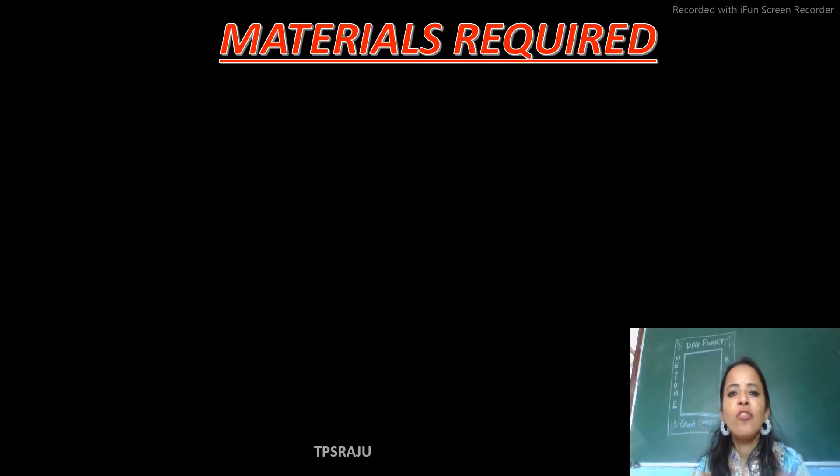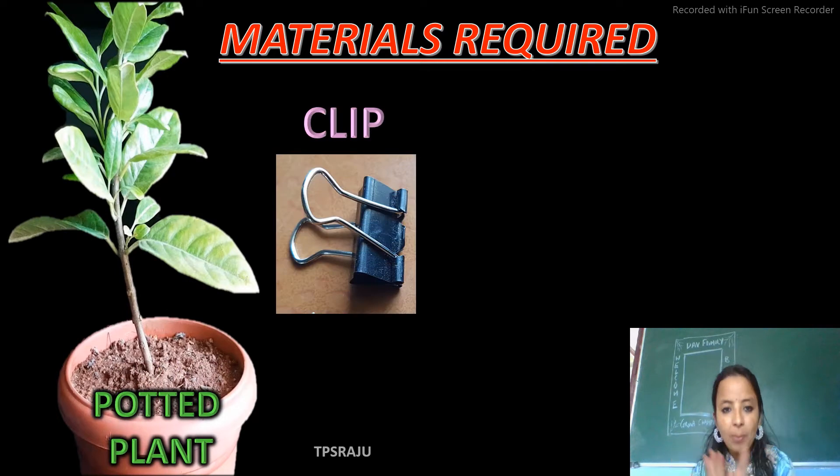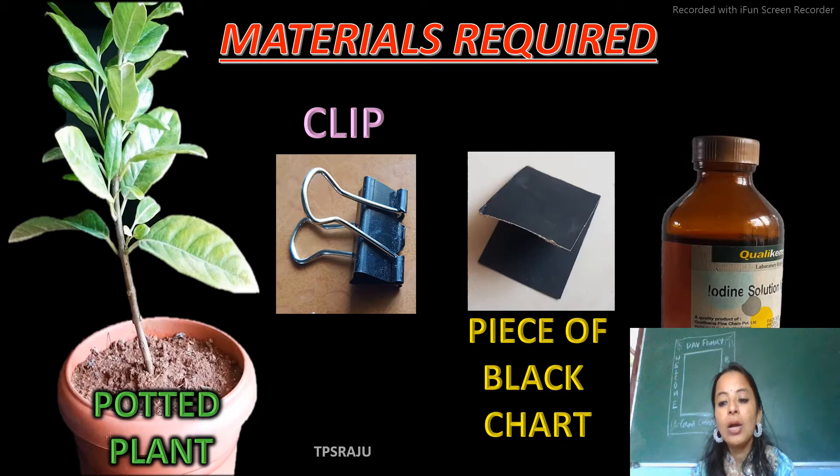First of all, the materials which are required for this experiment are: a potted plant, a clip, a piece of black chart, and iodine solution.